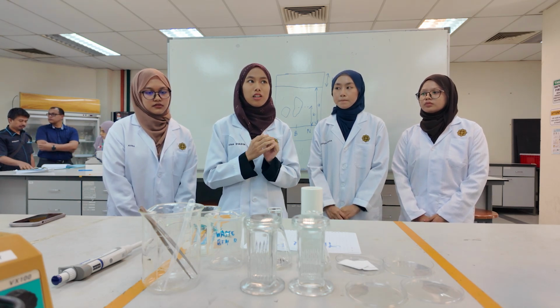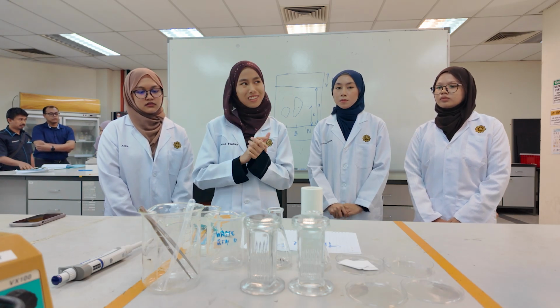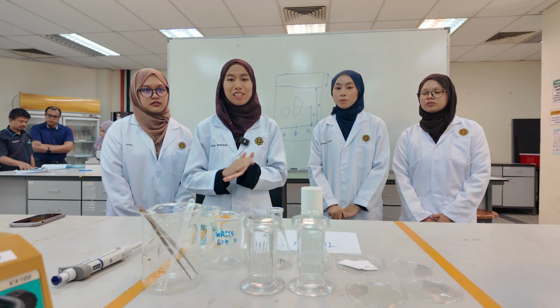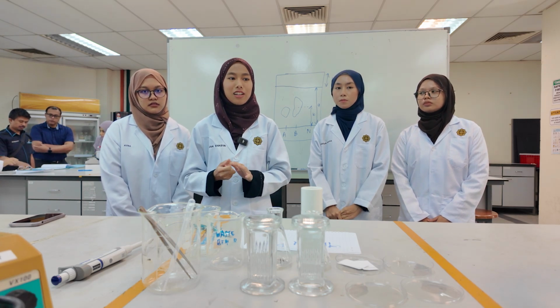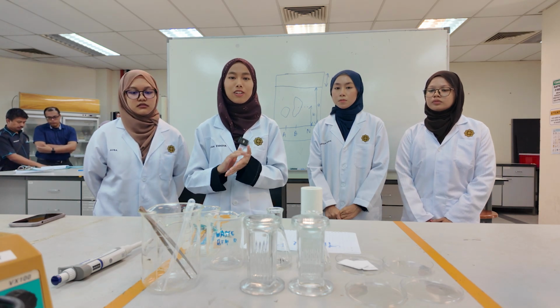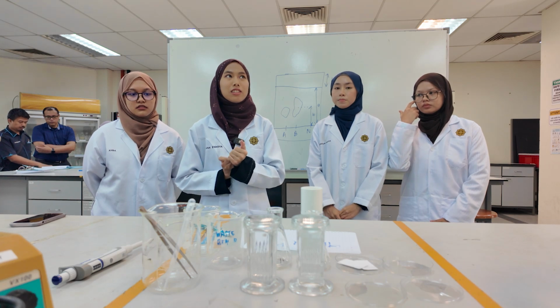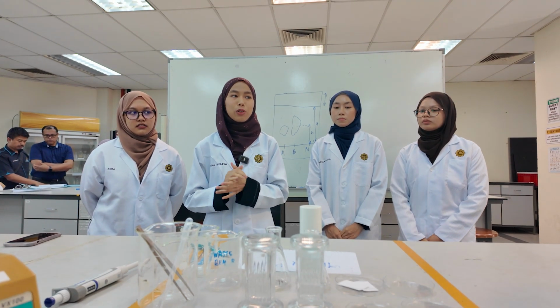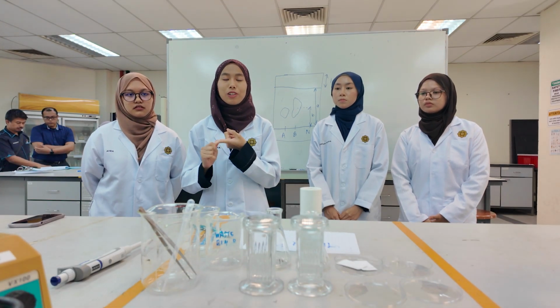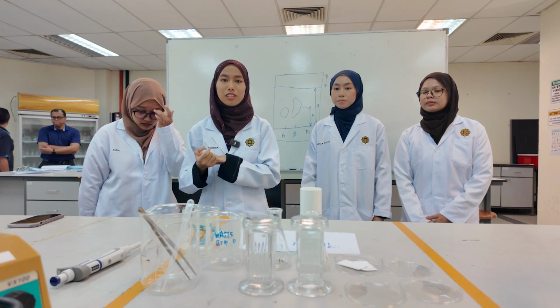The movement of each compound is measured using the retention factor, which helps us to identify and compare the substances. Next, the problem statement that we address is how we can identify an unknown compound and test its purity using a simple, small scale laboratory technique.